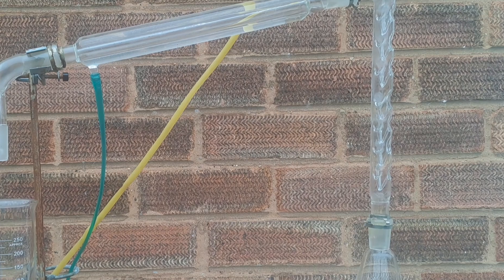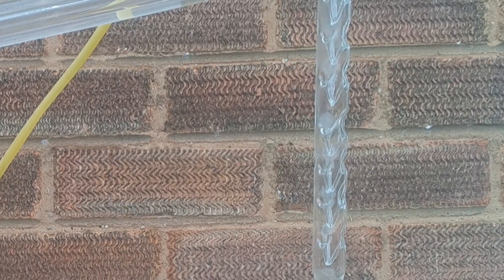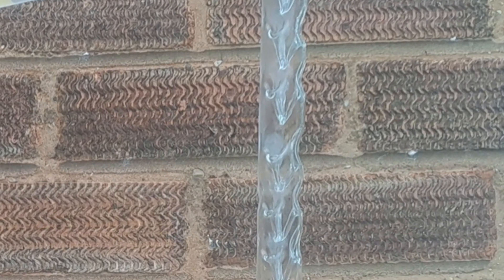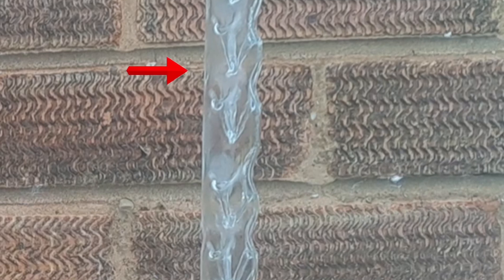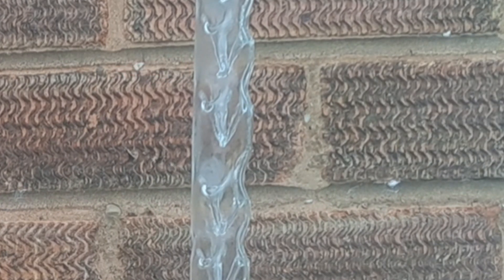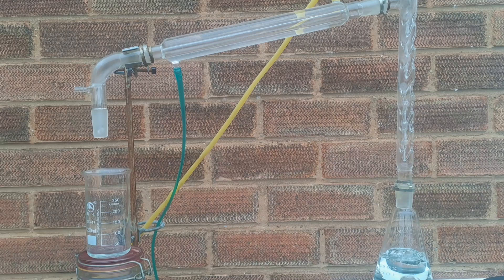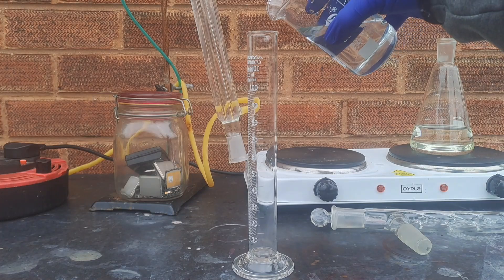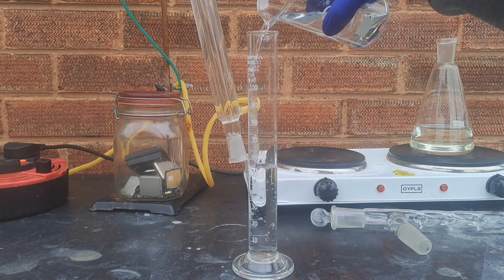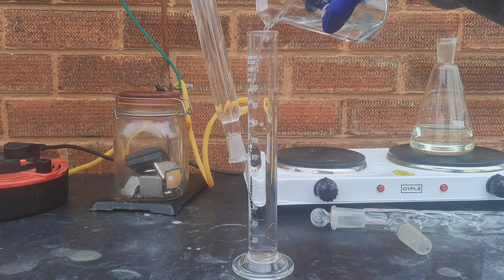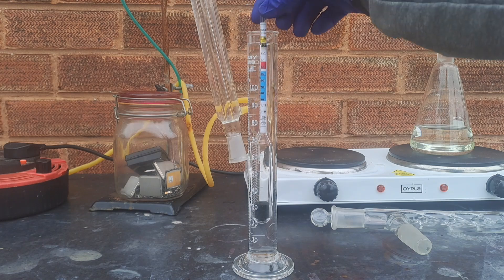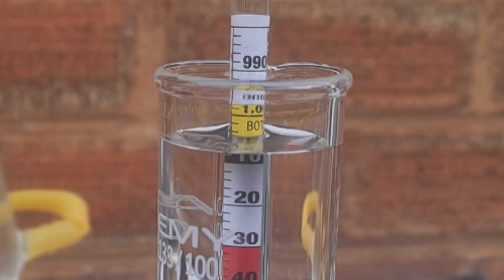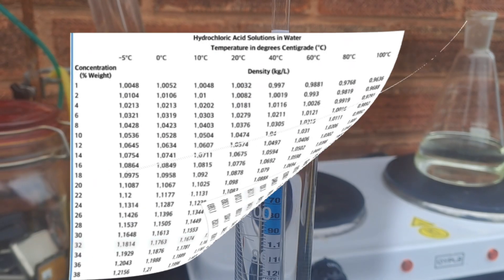If I zoom in, you may be able to see this in action. If you look closely at the center of the column, you will see a small drop of hydrochloric acid slowly form. I stopped the distillation when I started to notice acid dripping into the water — as the acid is more dense, you can see the droplets sink in the water. I'll test the specific gravity of the distillate to ensure it is mostly water. Water has a specific gravity of 1, and as you can see, the water fraction has a specific gravity of 1.005, which is around 1%.